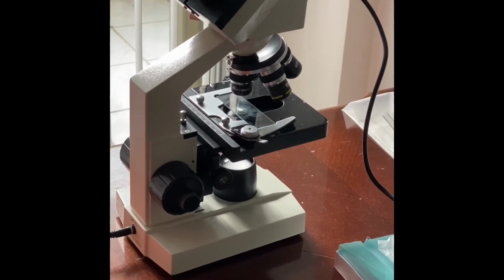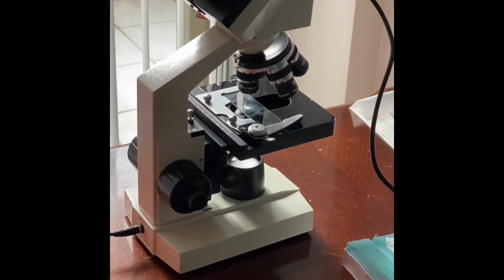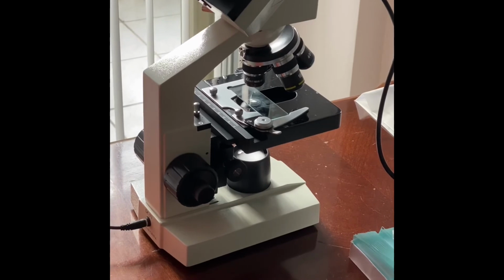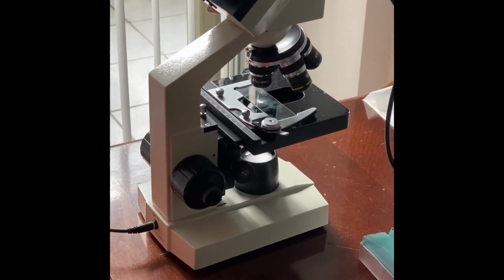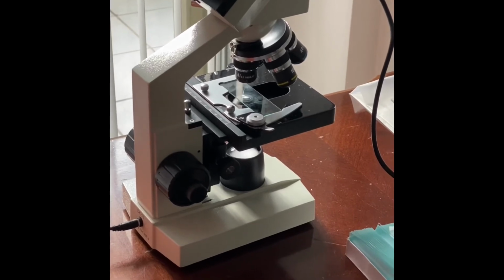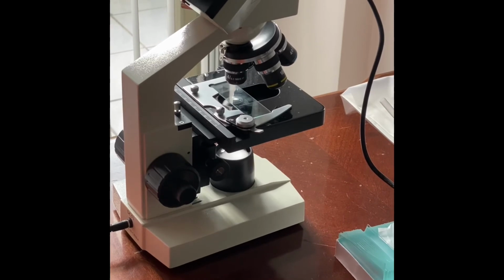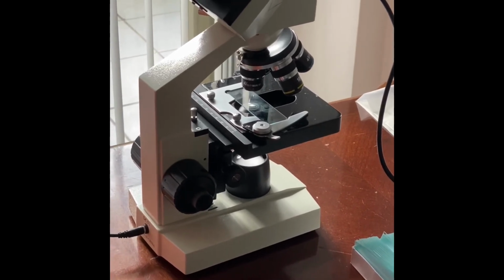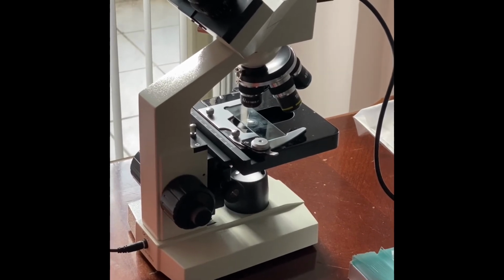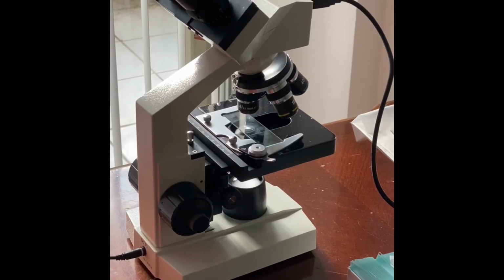And you may also, in the observations part, want to put underneath the materials used. We used a cover slip, a slide, a drop of water, and anything else you might think of. Write down your materials.